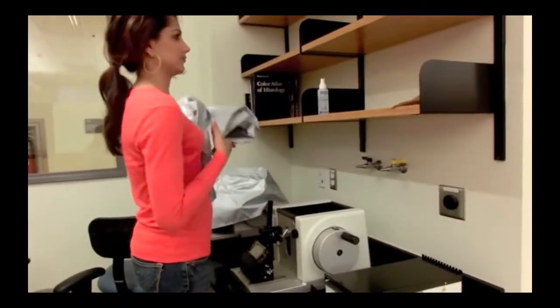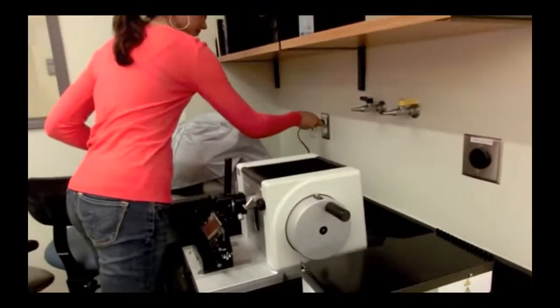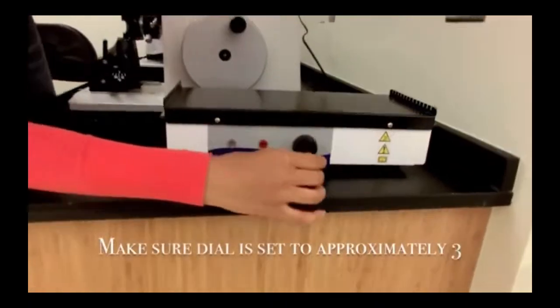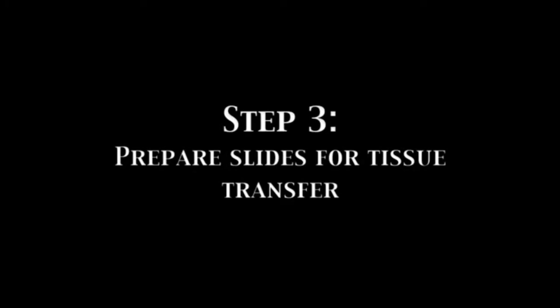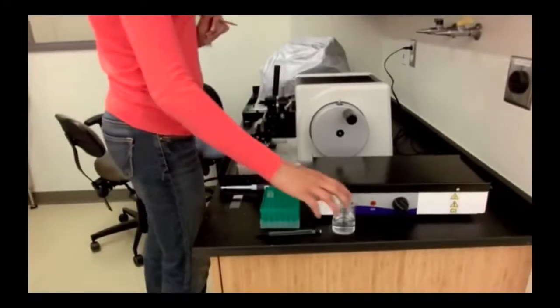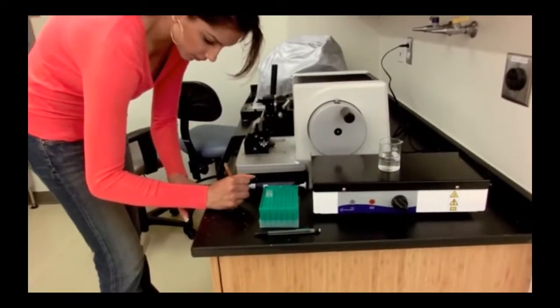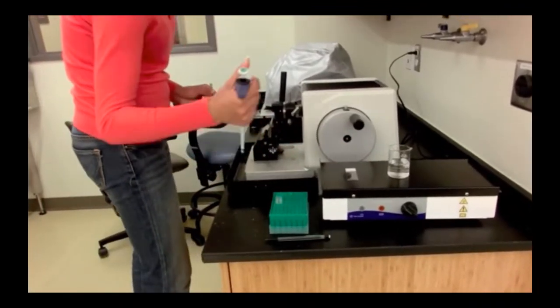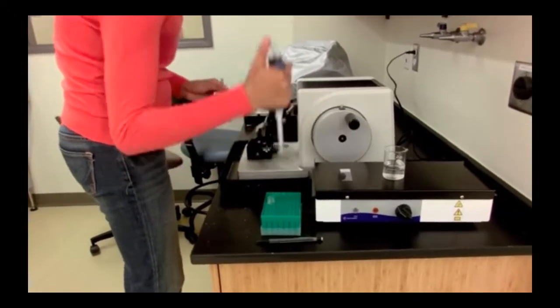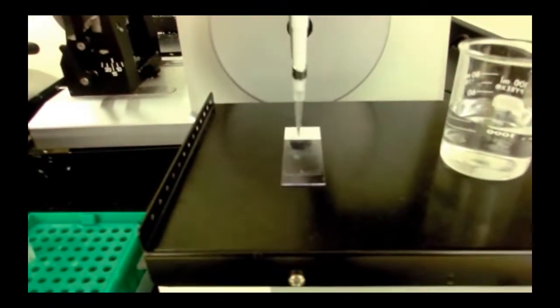Next, uncover the microtome. Next to this machine, you should find the slide warmer. Plug this in and adjust the dial to the middle position. Place a beaker of warm water on the slide warmer and keep a transfer pipette within reach. Next, remove a blank slide from the box and label it with your initials, organ type, and date. Place the slide down on the warmer and using a transfer pipette, put a few drops of water onto the slide.